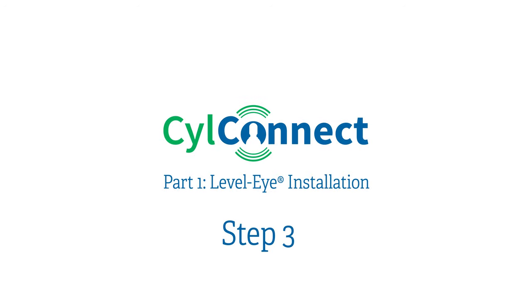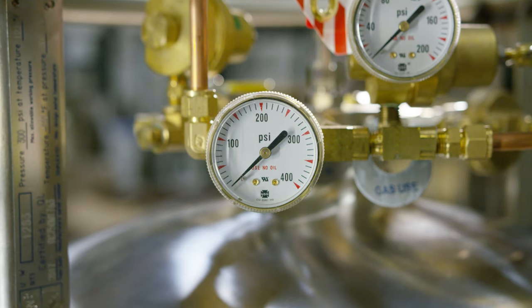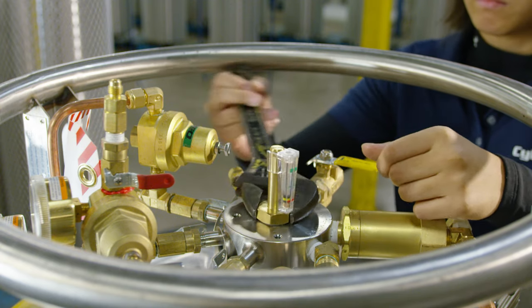Step three: before beginning installation, ensure that the tank has no pressure. Remove the float rod from the knuckle on the top of the tank.